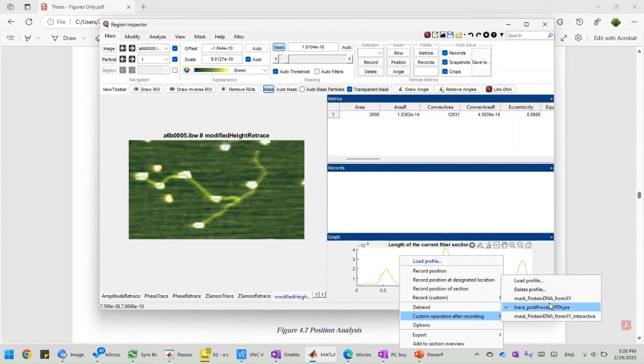For example, in this specific example, the script calculates the fraction position of your peak and sees if it's within the range of 39%, which is where I expect my specific site to be. If it's within 39%, plus or minus, for example, 5%, it labels that as a specific complex.